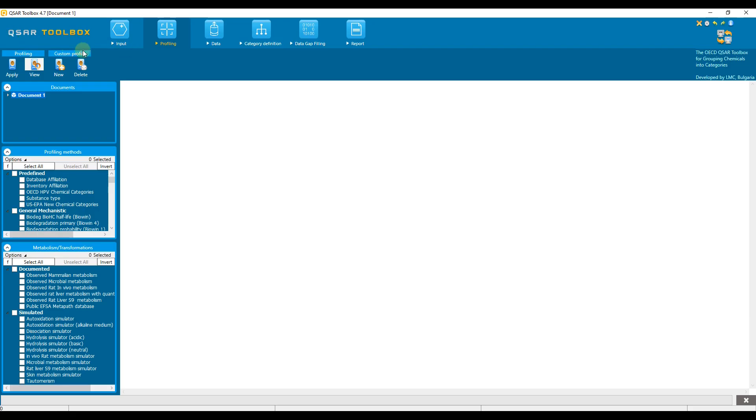The QSAR toolbox contains a list of documented metabolism databases and metabolism simulators that can be used for various purposes such as analysis of the profiling results or collecting analogs and other. In addition, the profiling information of the metabolites can be exported in Excel and analyzed outside the interface of QSAR toolbox.